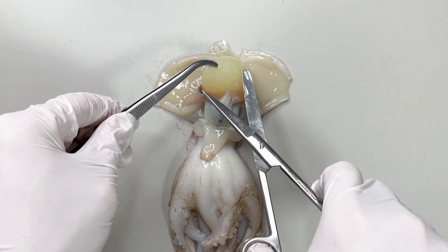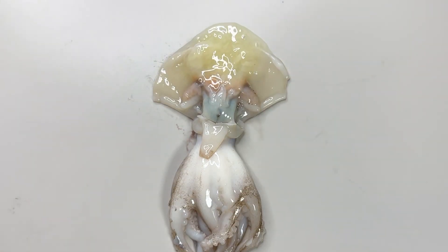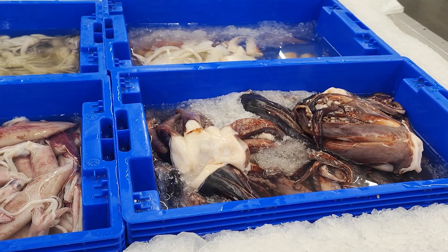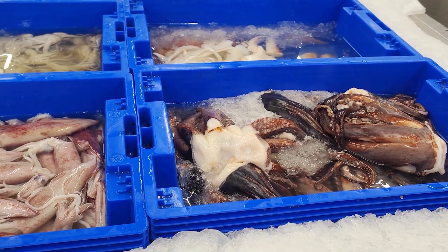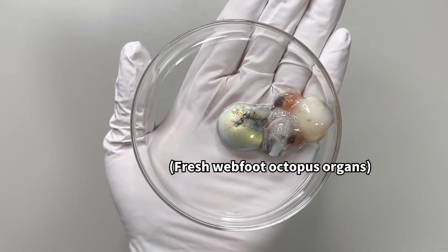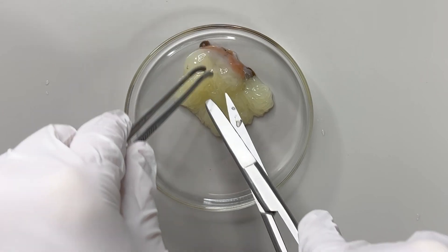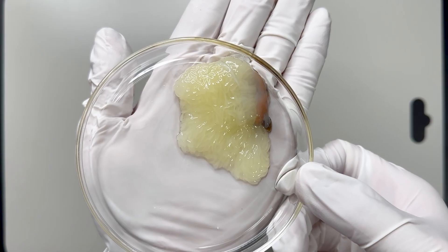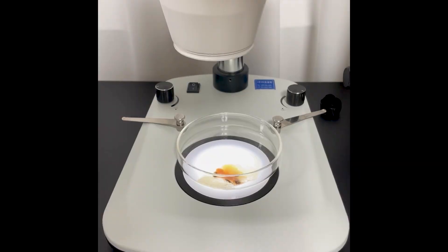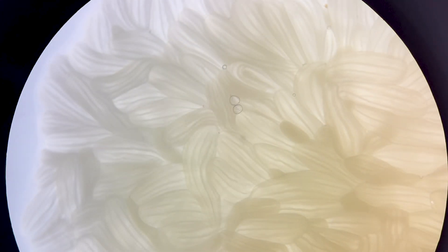We wanted to show you the reproductive cells inside, but because the octopus was previously frozen the cells were badly damaged. So we went to a nearby store and got fresh webfoot octopus innards. First let's cut open the female reproductive gland, or ovary — can you see it? Something poured out in large amounts. Under a microscope you can see countless rice grain-shaped eggs.